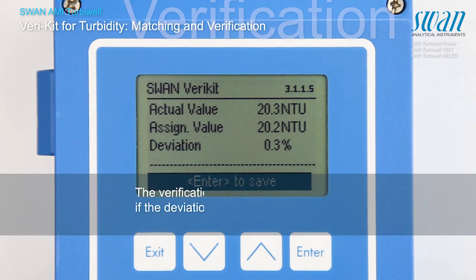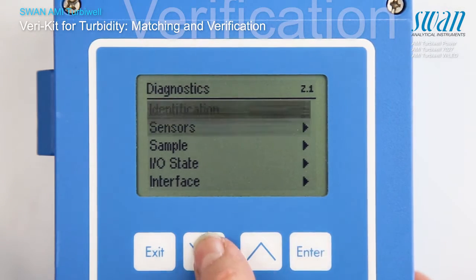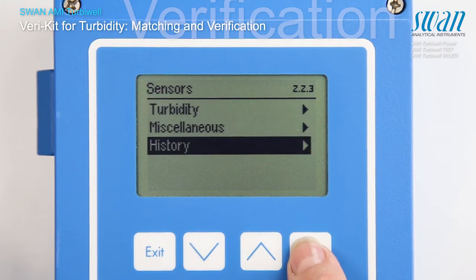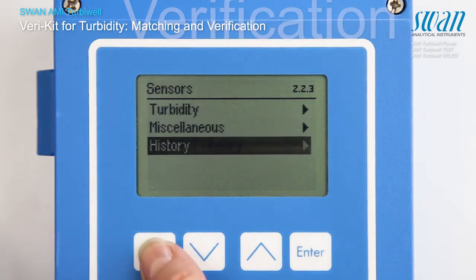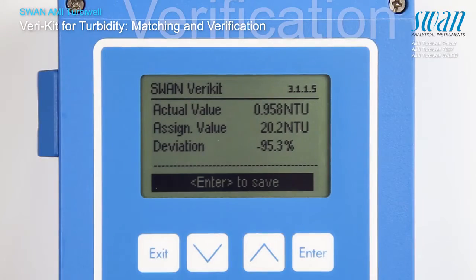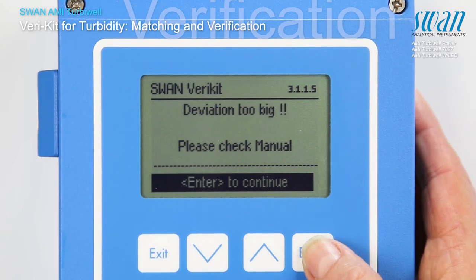The values of the successful verification are stored. In case the verification was not successful, the following error message will appear.